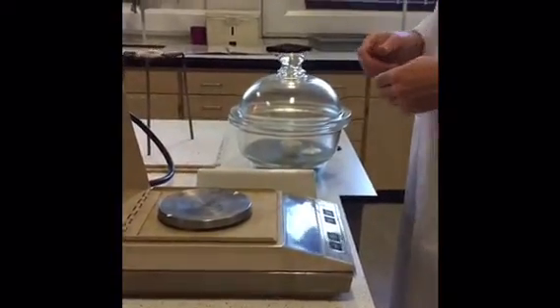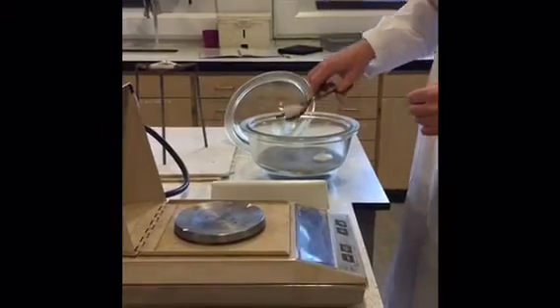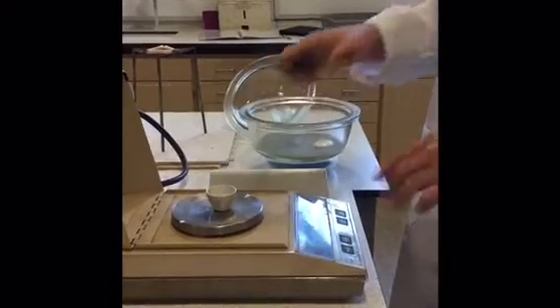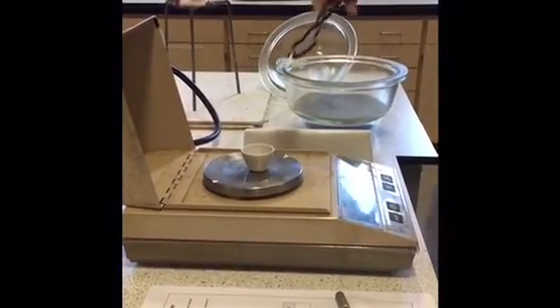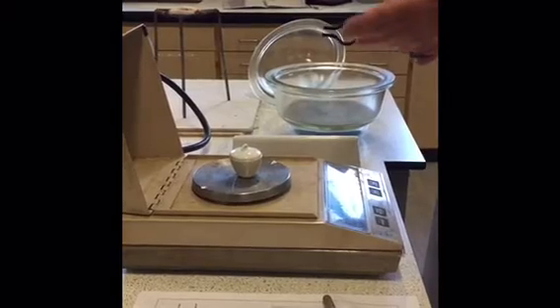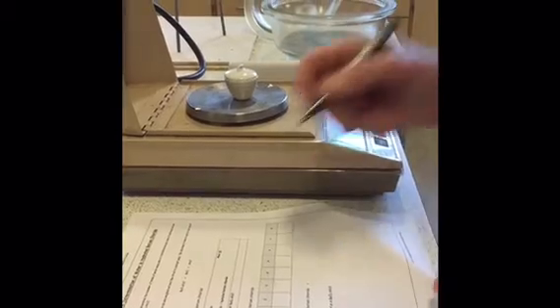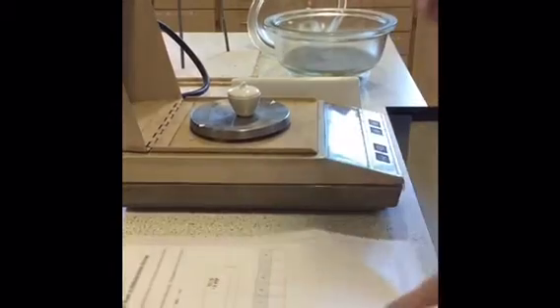So we've let this cool for 5 or 10 minutes. So we're now going to weigh the mass of our empty crucible plus the lid. Zero the balance. You might get a bit of movement on the third decimal place. There's not much we can do about that. And it's important you don't touch the crucible with your hands, or grease from your hands can get onto it and interfere with it. So the mass of our crucible plus lid is 19.888 grams. So I record that, 19.888 grams.